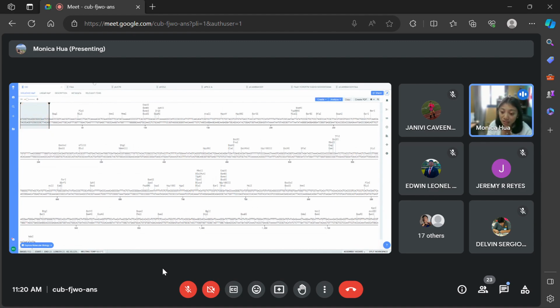The reason why we don't select many base pairs is because nucleic acids are known to form secondary structures. These ATGC and all of these things might look linear right now, but we know that they're capable of hydrogen bonding. The longer the strand, the more they can stick onto each other. If they stick onto each other, PCR might not be as efficient.